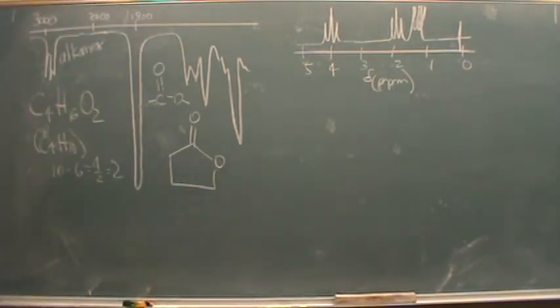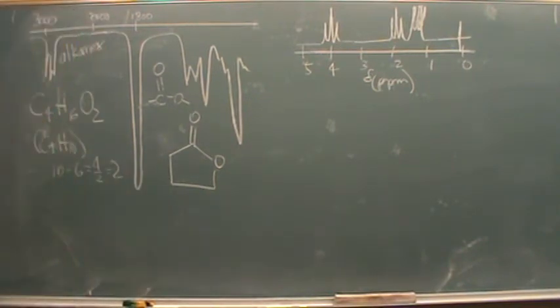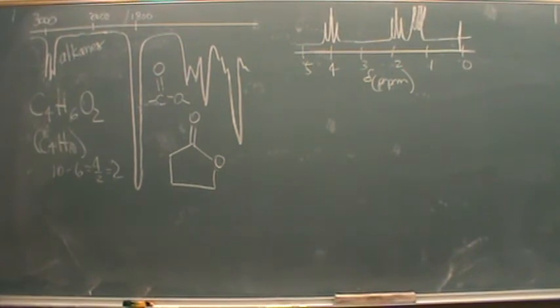Because that would give you 2 degrees of unsaturation. It'll explain why all the carbons are alkanes. And it would put in both oxygens for me. It explains the carbonyl. It's pretty nice. So I'm actually dealing with the ester here that's in the ring shape. Okay, I didn't even get to the NMR yet, and I think I have the answer.